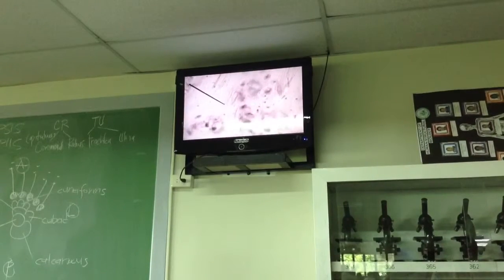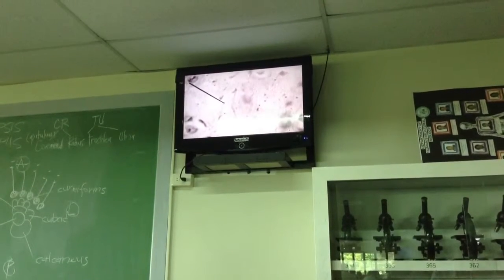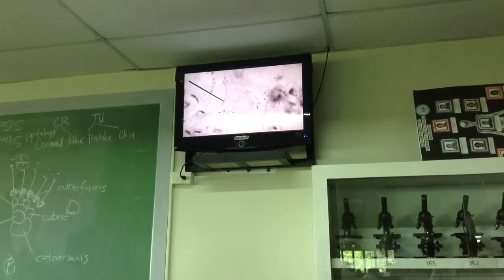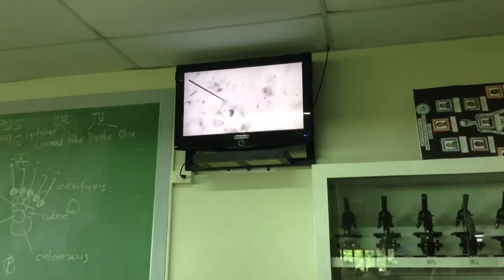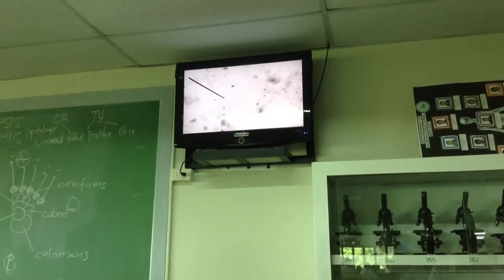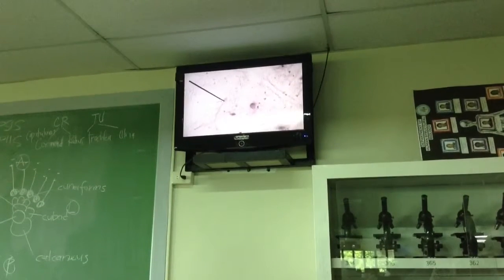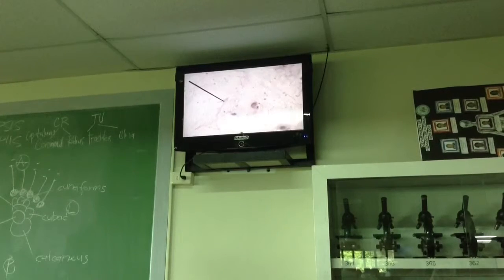So hindi po libag yan. Those are elastic fibers. So you would best see them at high magnification. So these are the elastic fibers. Kaya siya mukhang madumi because of the presence of these elastic fibers. Ayan po, nagkalat ang mga elastic fibers. You don't see these elastic fibers in the hyaline cartilage. Kaya mukhang makinis ang hyaline.